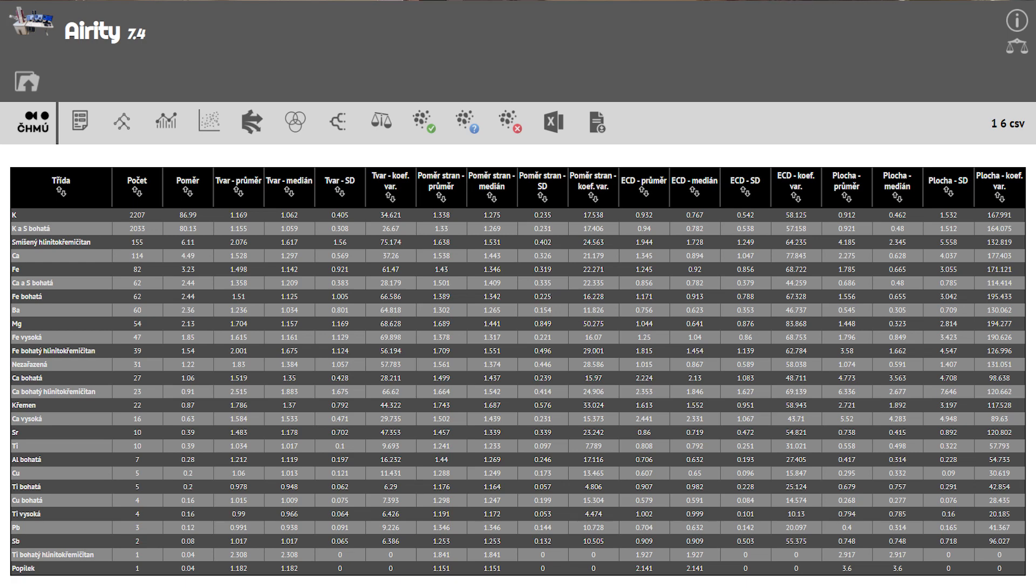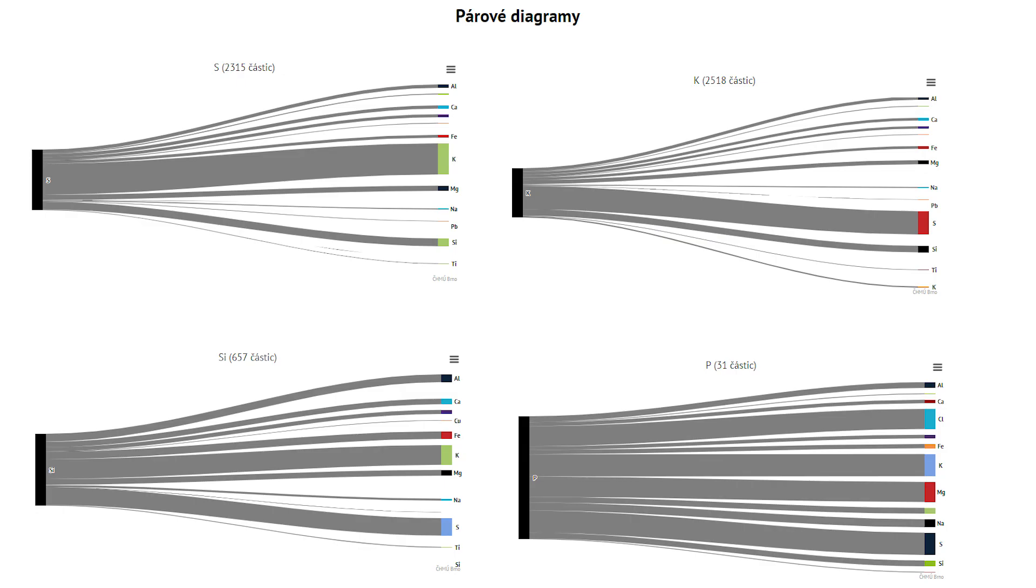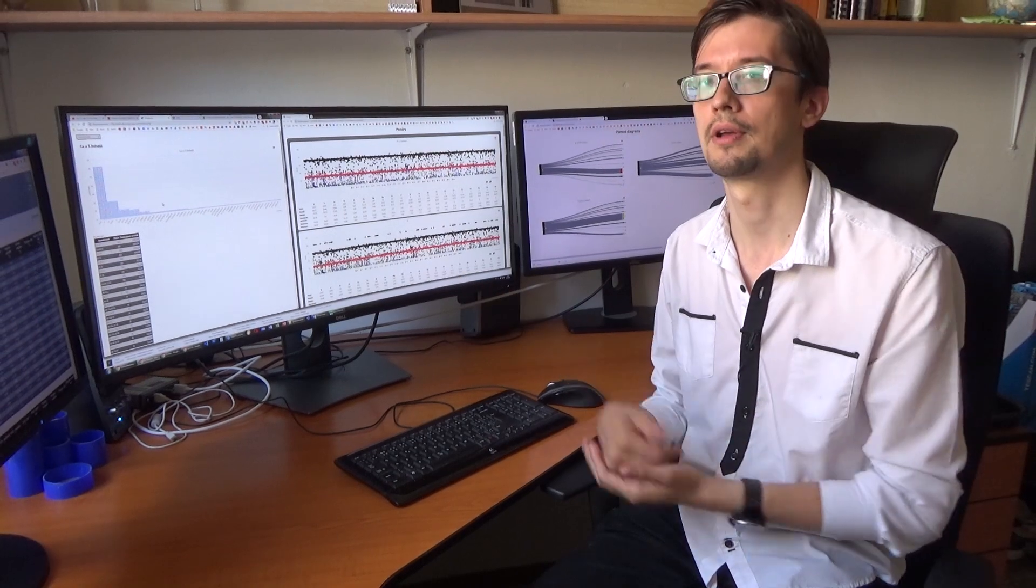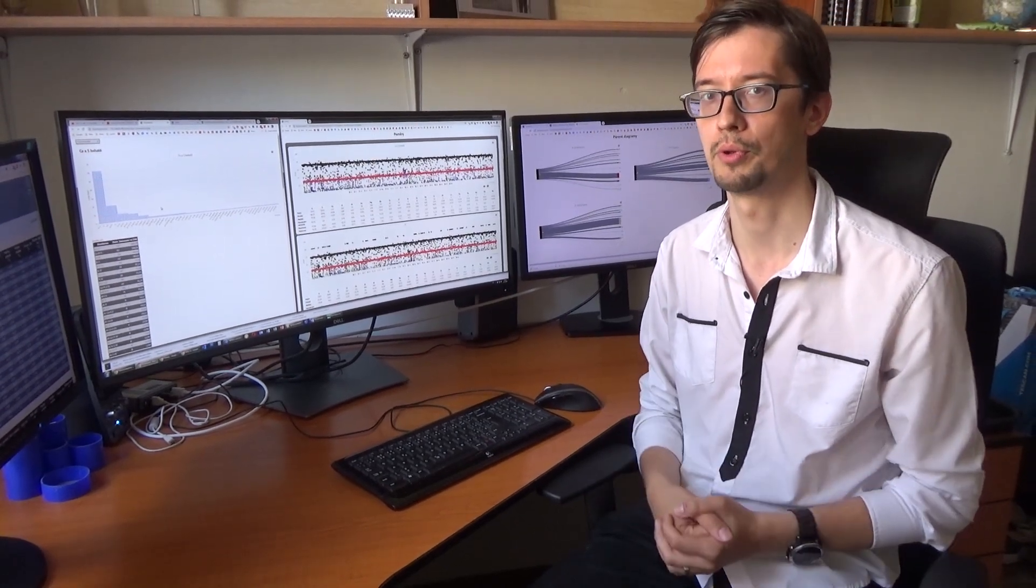But it allows us to physically look at individual particles, take pictures, and analyze them. This can be key to identifying particle sources and therefore reducing that particular pollution.